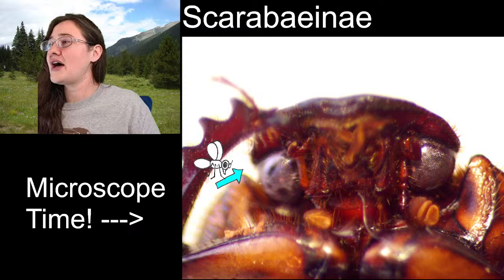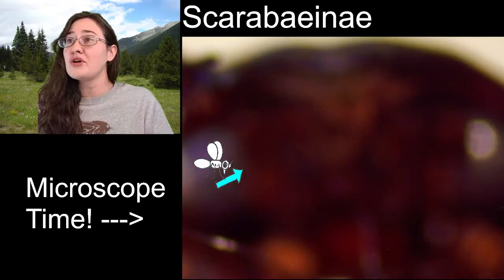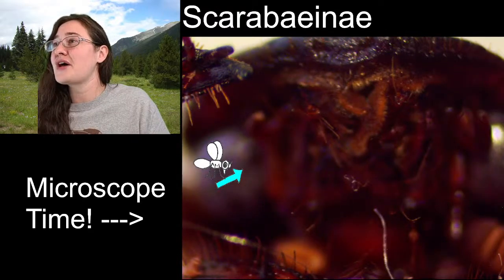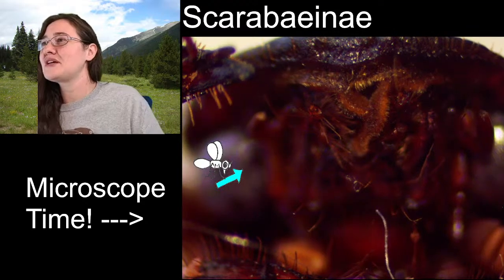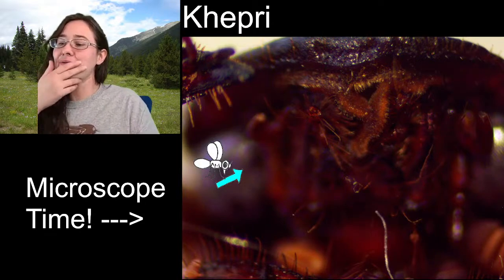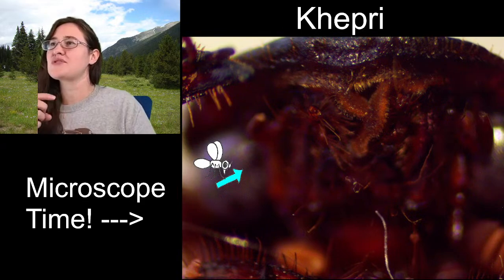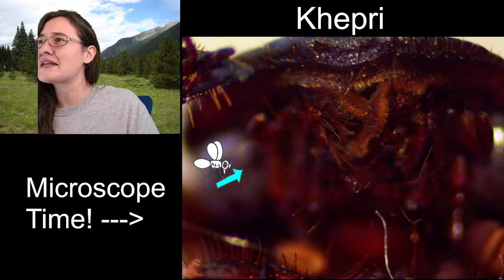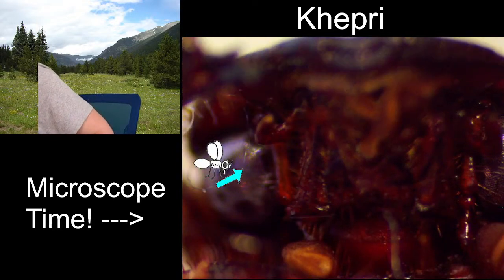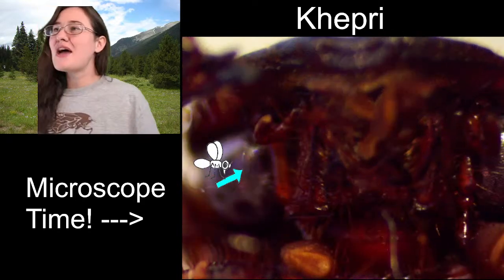Cass mentioned dung beetles being associated with royalty, and the dung beetle god from Egypt, its name was Khepri, and it was the goddess of rebirth, or sometimes people say of life. And I was really hoping to see some mouth parts. All right, so I'm not seeing very many mouth parts.